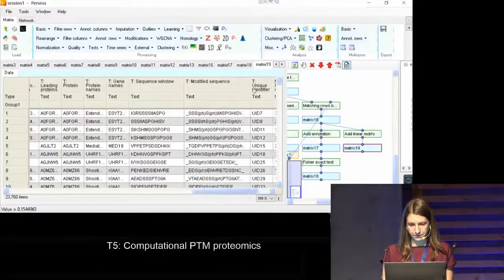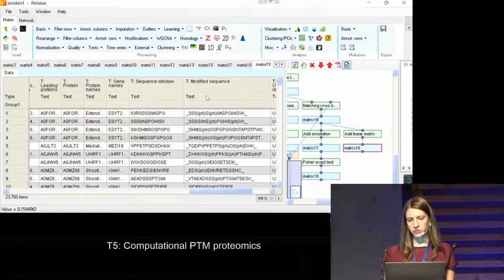There's another one here, just for information, called modified sequence. Actually, it contains the peptide sequence and where the modification occurs. So you could actually know it's this third serine and the fourth, but not any of these two or this one or the last one.